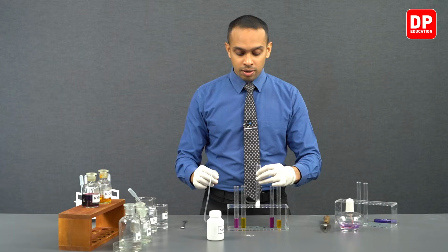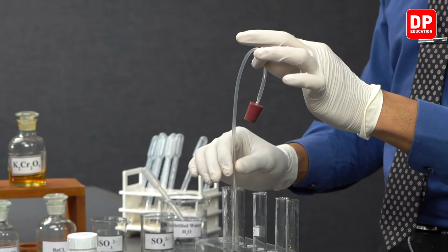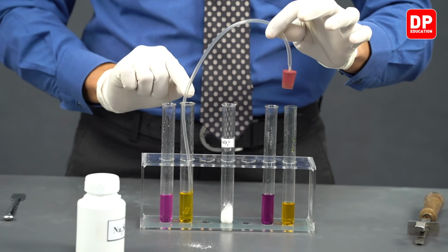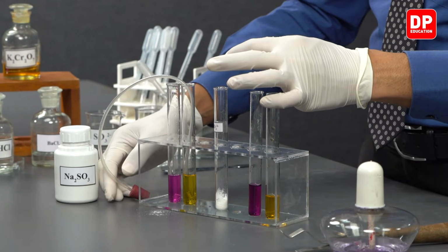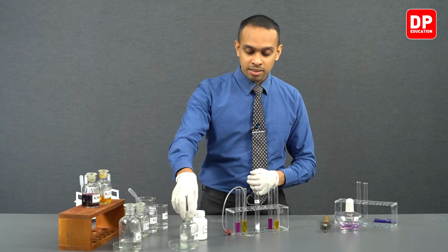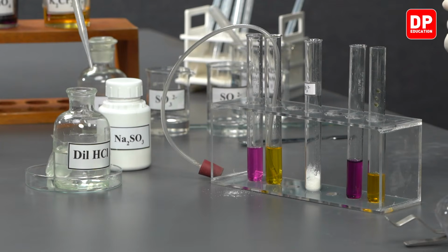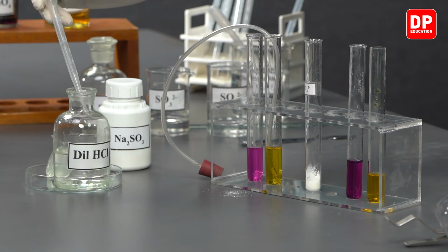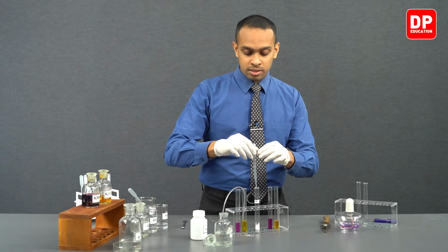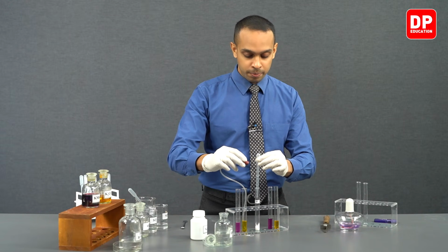So we'll keep our delivery tube ready. In fact, we can place the open end of the delivery tube in our acidified potassium dichromate solution like so, and then we can keep the rubber stopper aside for the time being. Then we can take our HCl that we have over here and add a small volume of HCl into this sodium sulfite solid that we have here. As soon as we add it, we are going to close it with this rubber stopper.